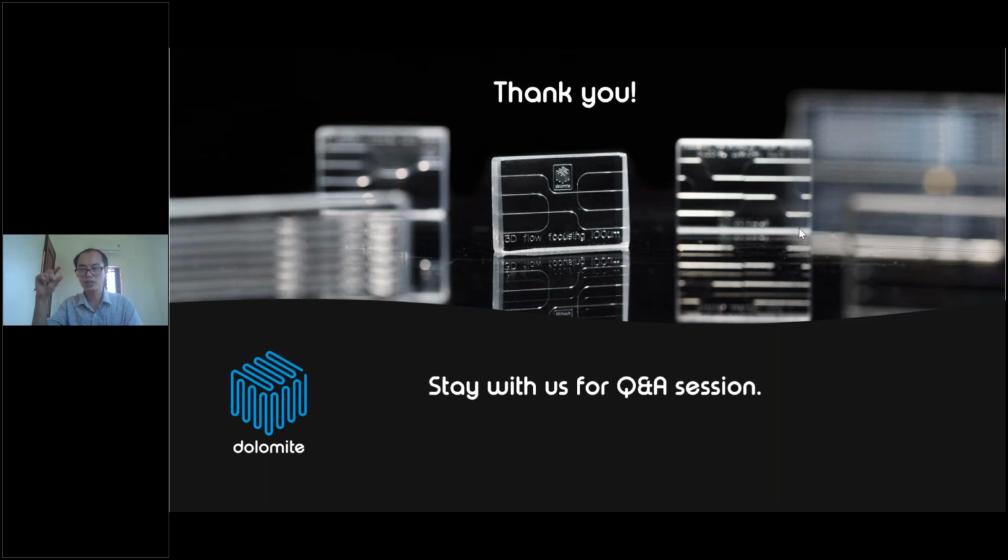A bigger chip junction size generates a bigger droplet, and a small chip junction size, a small droplet. So two factors: one, droplet size, and second, a higher concentration of PLGA, but not too high because PLGA has a high viscosity at a high concentration. So the limitation may be around 10 to 15% of PLGA in DCM. I hope this helped.